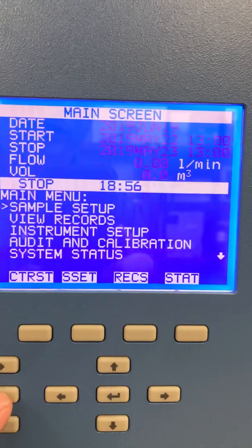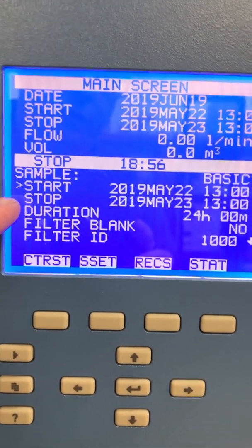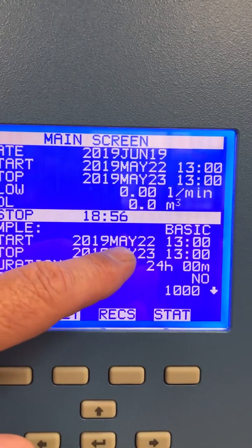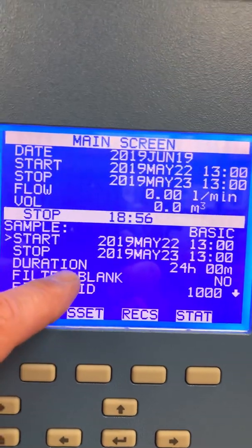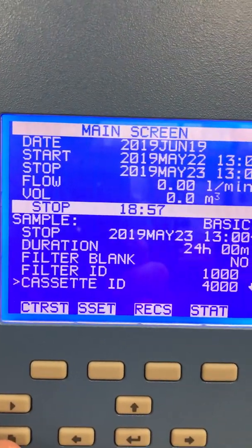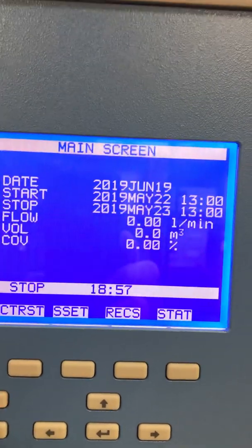There's a menu button here, and we can go into sample setup, hit enter, and then scroll down to sample. Hit enter, and this is where you'll set up the start time and the stop time for your sample filter. It's set up in basic mode, and that mode will run midnight to midnight, 24 hours. For example, it would start at midnight on May 22nd and end at midnight on May 23rd. It's set for 1300 hours here, but typically this would be 0000 — midnight to midnight — and you can see it's a duration of 24 hours. It asks if this is a blank filter — it says no. You can put a filter ID in here as well, along with a cassette ID, site ID, and filter type. Once you've got this information programmed, you can save it and go back to the main screen, and it will change to run.